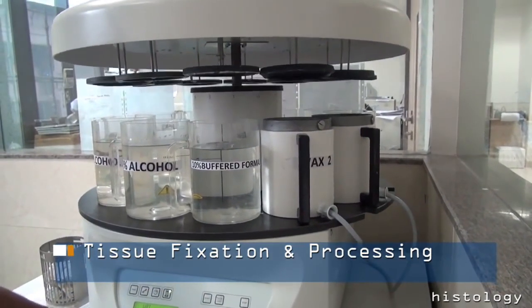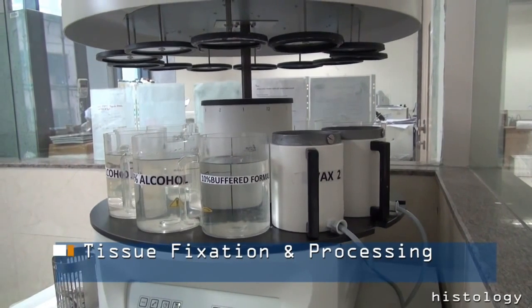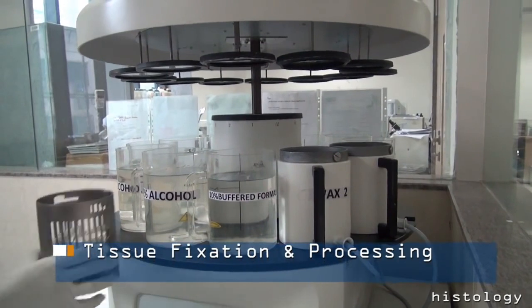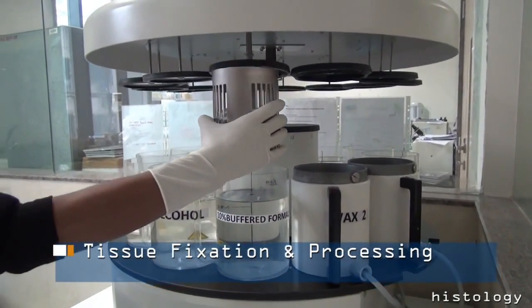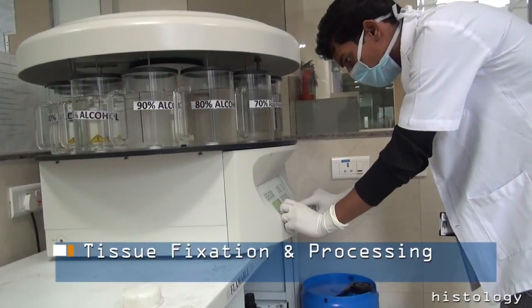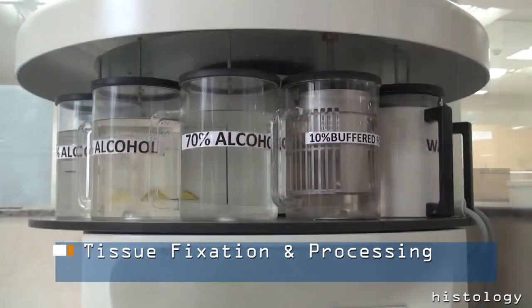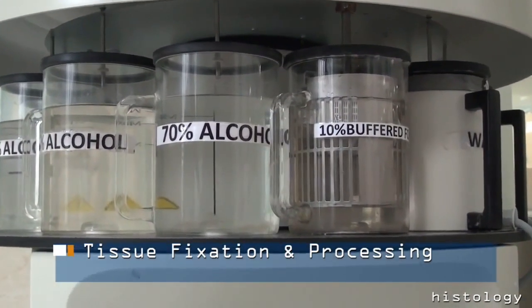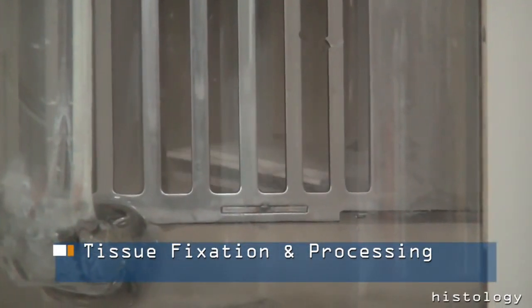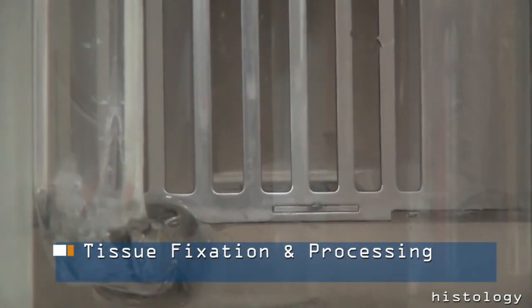Tissue fixation and processing. An essential part of all histological and cytological techniques is preservation of cells and tissues as they naturally occur. Hence the objective of tissue processing is to stabilize the tissues or cells and preserve their morphological, anatomical and biochemical characteristics for accurate diagnosis. To accomplish this, tissue blocks, sections or smears are usually immersed in a fixative solution. The most commonly used fixative is 10% neutral buffered formalin.